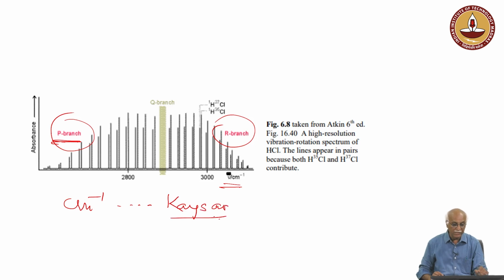Right, what does centimeter inverse mean? It represents the same thing as the frequency. Basically, within 1 centimeter, the number of cycles it completes is represented by that number. That number is centimeter inverse.